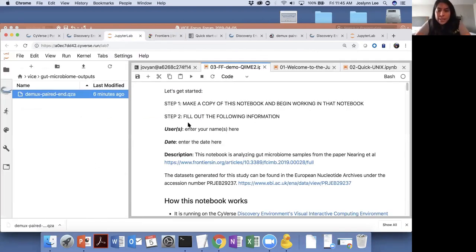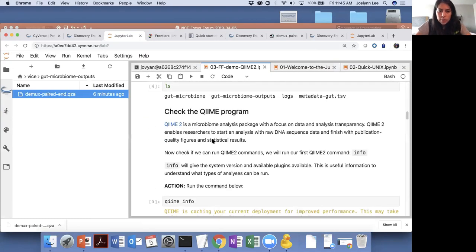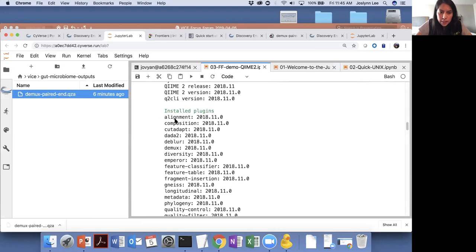Jocelyn? Yes. There is a question about someone trying to upload sequence data, but when they tried to upload, there was a continual ask for metadata files. Can you explain that part a little more? Within QIIME? Okay. Let's see. So I'm going to go ahead and type in.